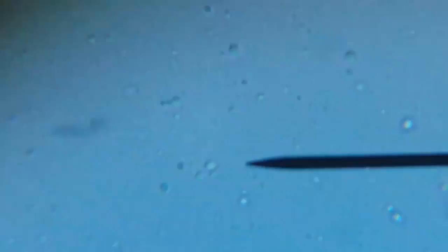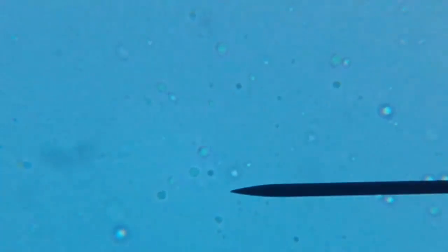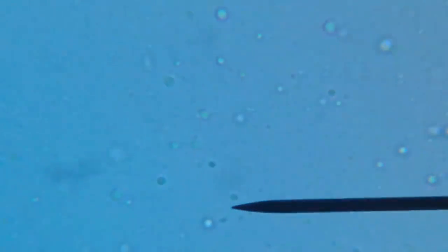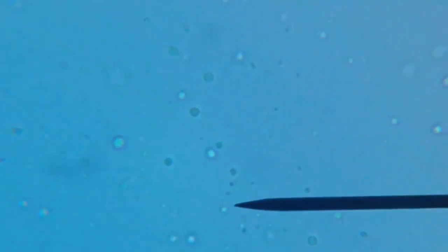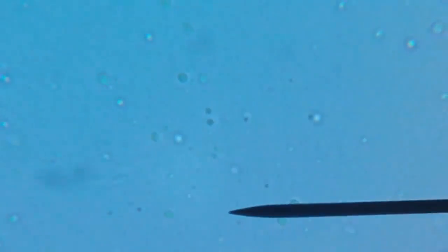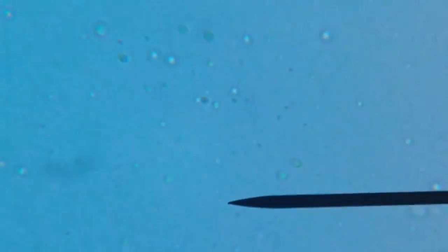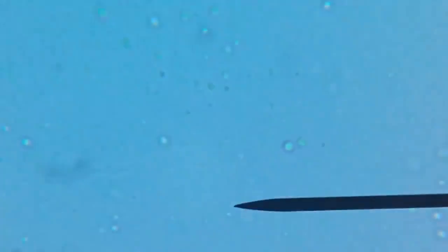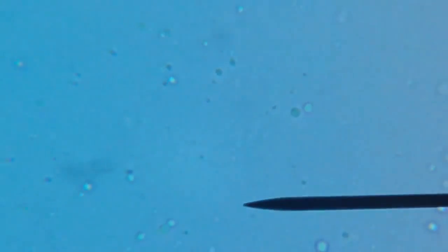If I zoom in, you'll notice the little drops of milk fat are very animated. Now, back then, they didn't know what this was. Some people thought that maybe these are living organisms, kind of like what you would see in a pond sample. Some people thought that maybe it was a mirage, kind of like on a road on a hot day, causing maybe a little rippled appearance.